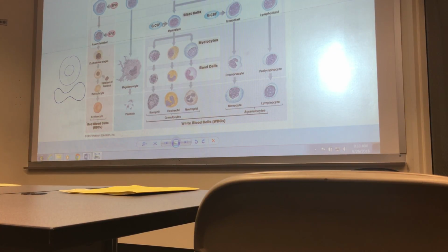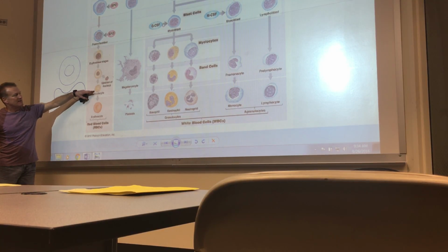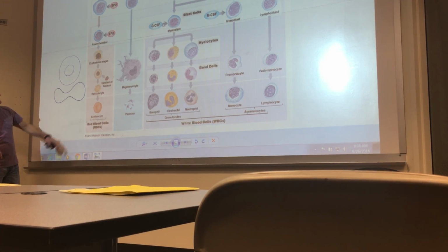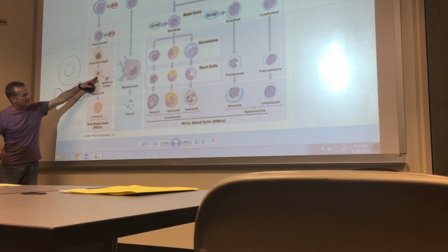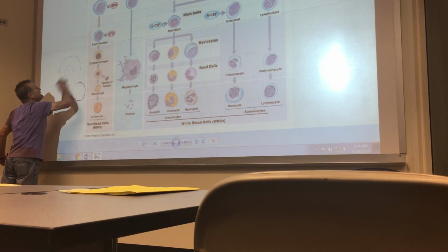And you'll recognize this from the DVD as well. In reticular connective tissue, the cells that make the fibers are called reticuloblasts or reticulocytes. Some people have trouble with those words because a reticulocyte is also an immature red blood cell. So anyway, they show here the nucleus being ejected as we move to the actual mature red blood cells. So red blood cells are anucleated.